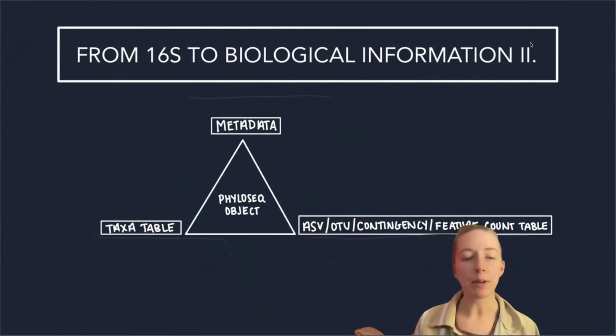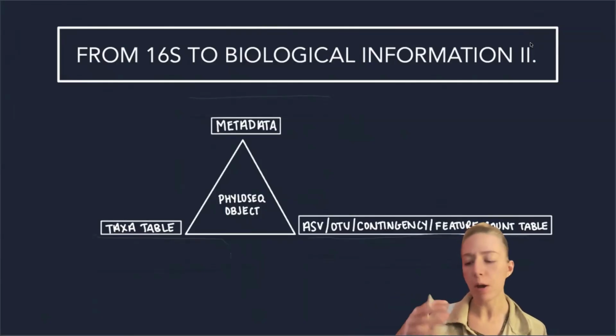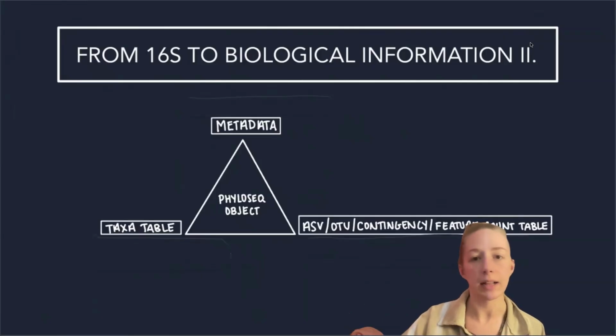Hi everyone. Today we're going to be talking about the second half of 16S data analysis and data handling. So we're working on our workflow from 16S, pre-processing and data analysis, and now we're going to be handling the data to make it more suitable for our downstream analysis.